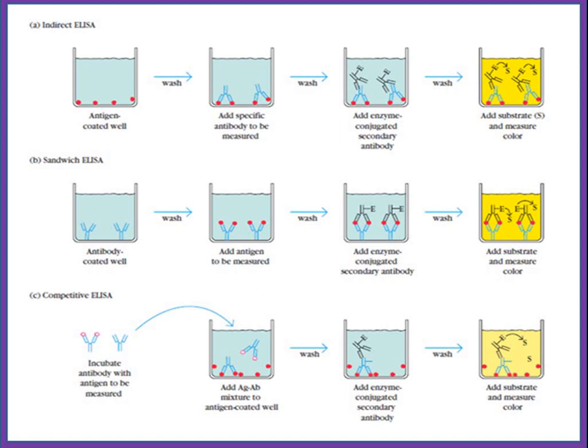Then finally we have to add the specific antibody which was conjugated with enzyme. So the specific enzyme conjugated antibodies are added to the same well. The antibody can easily bind with the antigen molecule. This reaction forms a sandwich: initially immunoglobulin, then antigen, then again immunoglobulin. So this reaction will be a pure sandwich model.